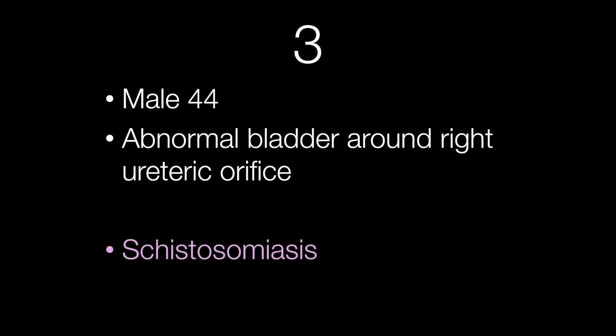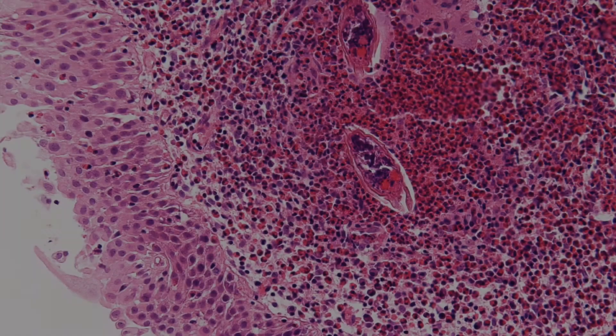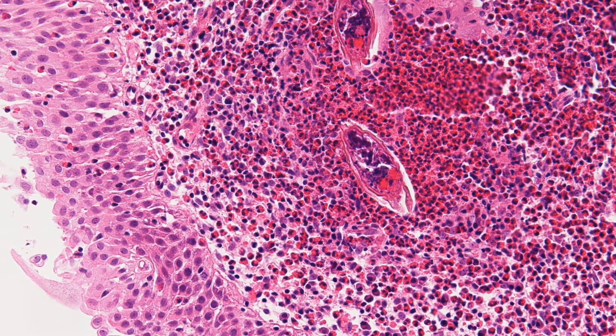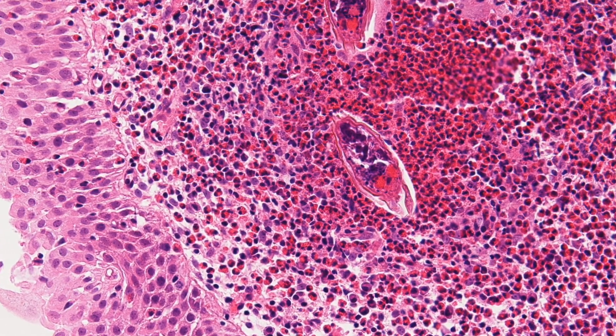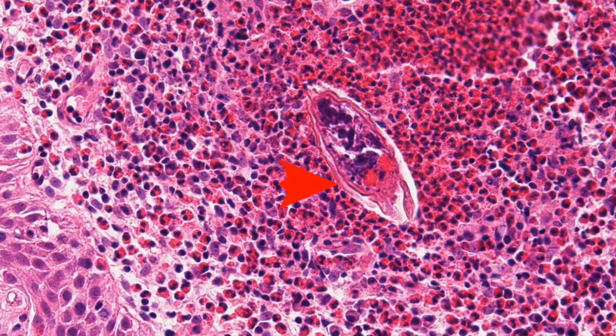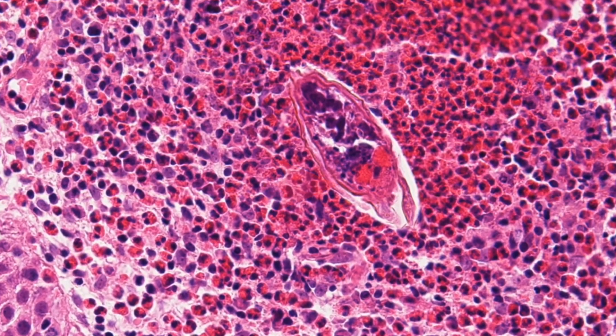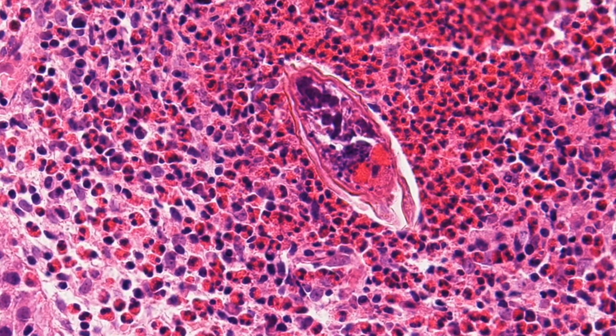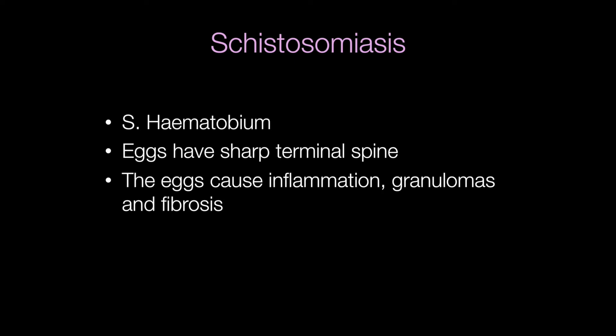This is an example of schistosomiasis. Among the inflammatory cells you can see schistosome eggs, and at the bottom of the egg here is a terminal spine. It is the terminal spine that is classical of Schistosoma haematobium, which causes schistosomiasis in the urinary tract.